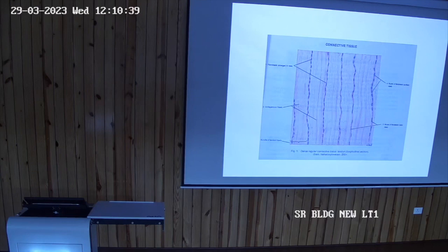Now try to understand. Such a picture you will also see in the skeletal muscle, longitudinal section. The reason is, if you do not see the slide properly, you will see the same picture, so you may miss that. You may label the skeletal muscle as an LS of tendon, because the nuclei are flattened, multiple nuclei. The same multiple nuclei on the periphery of the skeletal muscle fiber you will see.